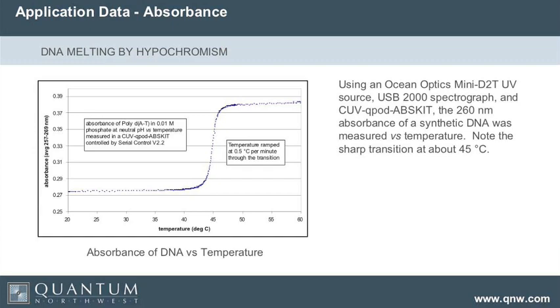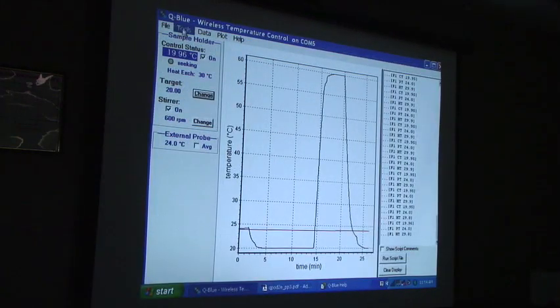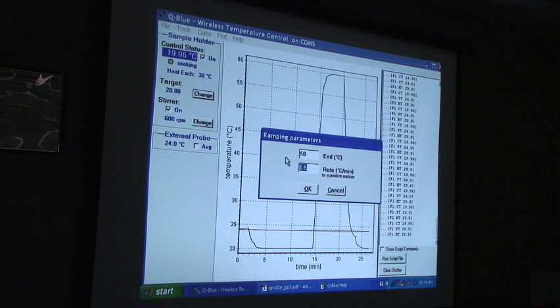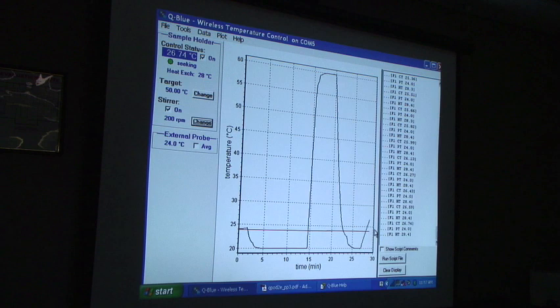So let's do a ramp. We're pretty close to 20 degrees right now. To do a ramp, all you need to do is go up to temperature ramping. Let's do 3 degrees per minute, go up to 50 degrees — doesn't matter where you go to — and say OK. When we say OK, it'll change those parameters. And you can see that we're off on a linear ramp now, ramping the temperature at 3 degrees per minute.